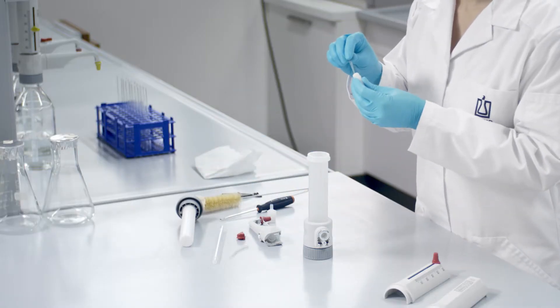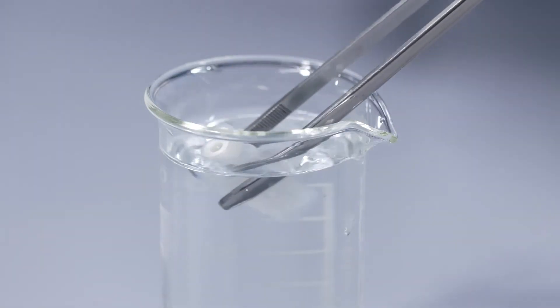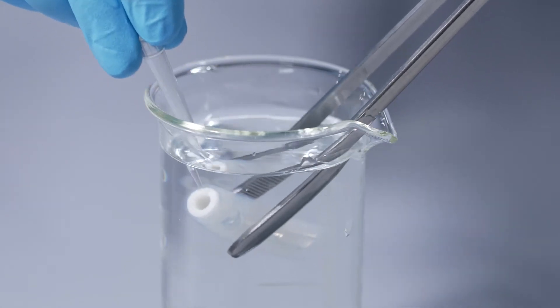Check the valves for deposits. If needed, loosen the ball valve using light pressure. You can use a 200 µL pipette tip. Clean or replace the valves as needed.